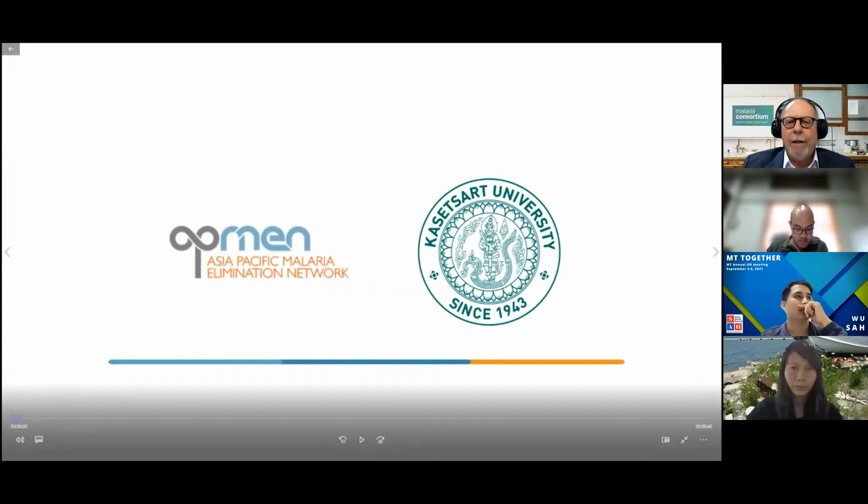The test should be run for the entire 2 hours unless all mosquitoes have died earlier than the 2 hours. Okay, Wulan, can you put on the video for us, please? Thank you.